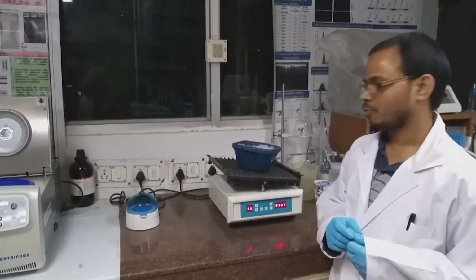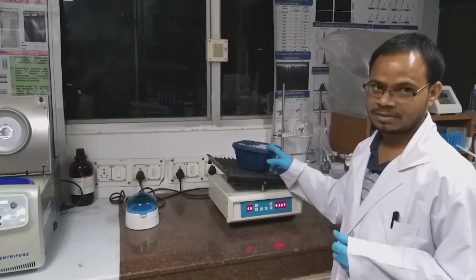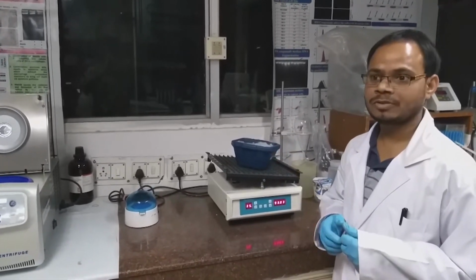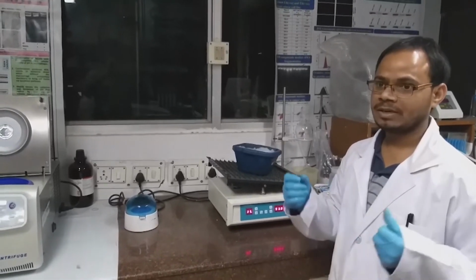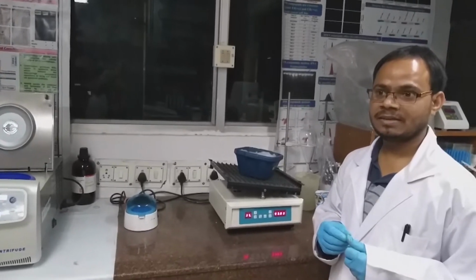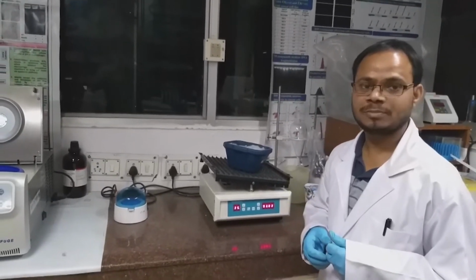So once column packing is over, we kept it in ice and we'll keep in this condition for at least 2 hours for binding, so that the His-tagged protein will bind to the nickel NTA, and in further steps we will elute the protein.